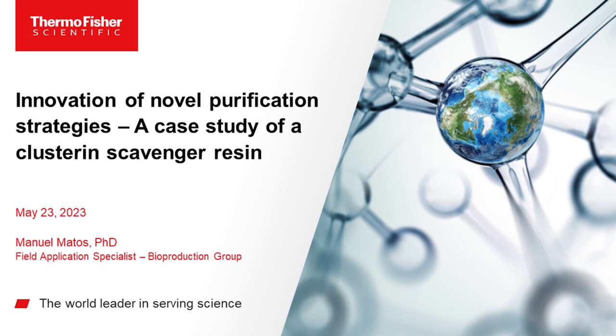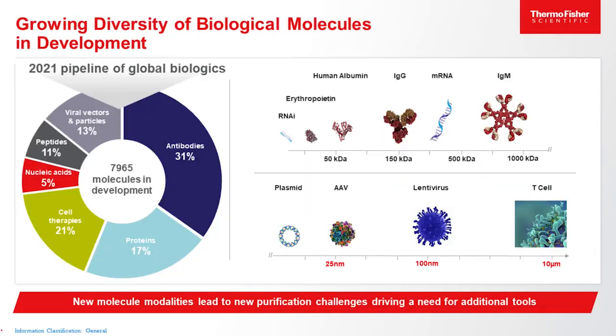So without any further delays, I will start my presentation by showing you the growing diversity of biological molecules in development. As you can see on the chart on the left, the major portion of molecules is still monoclonal antibodies, but there has been increasing interest in viral vectors, nucleic acids, and cell therapies.